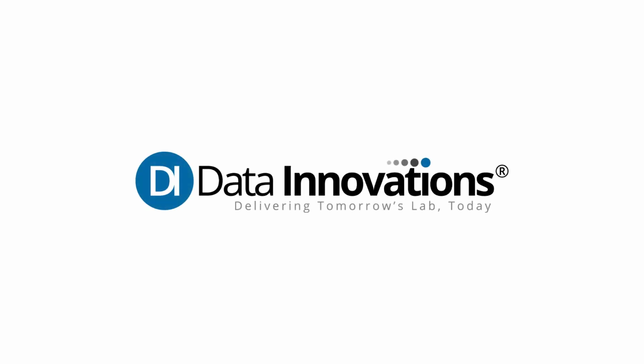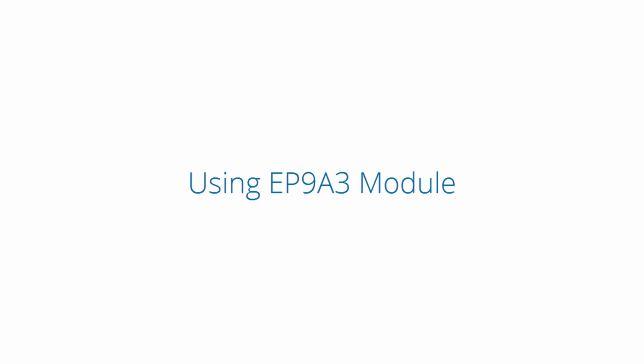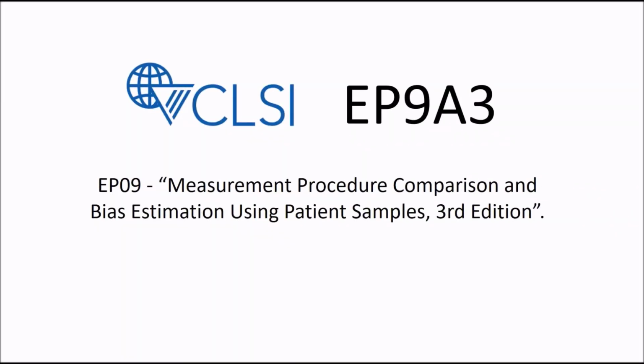In this video we focus on the major enhancement in EE12 over previous versions. That is the EP9A3 module, which was developed from the latest CLSI EP9 document. CLSI EP9 describes standard procedures for method comparison evaluations. The EP9A3 module is based on the third edition of this document.